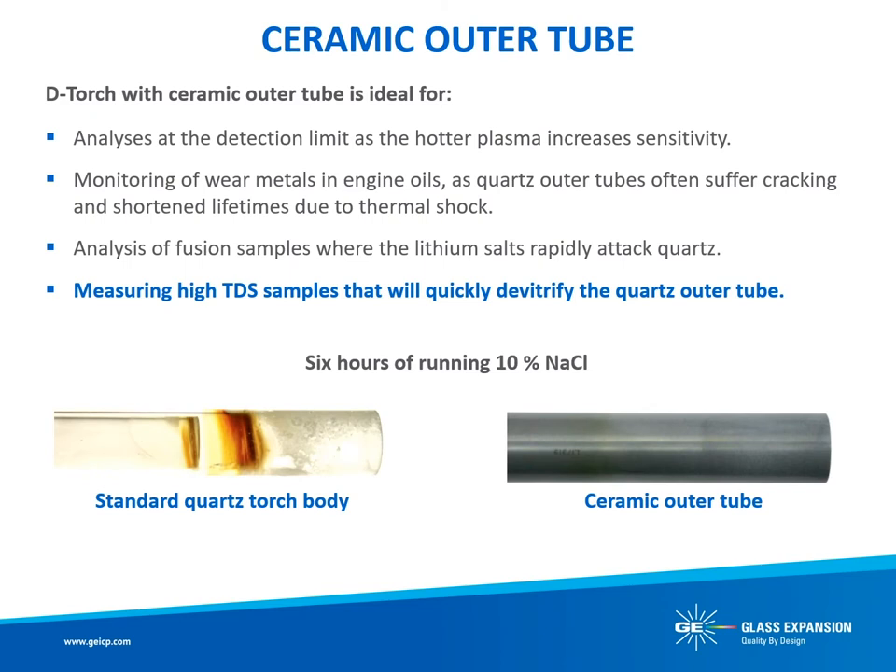Also unique to the D-Torch is our optional ceramic outer tube, which is of particular benefit for the analysis of aggressive sample matrices such as hydrofluoric acid, organic solvents, and high total dissolved solids, because the Cylon outer tube material does not de-vitrify and can withstand higher temperatures. Compared to a quartz outer tube, the ceramic outer tube has a much longer lifetime, greatly reducing maintenance, cleaning, and downtime due to torch failure. In some sample matrices, quartz outer tubes can degrade in hours, while the ceramic outer tube will last years under the same conditions. As an example, we can compare a quartz outer tube to a ceramic outer tube, both of which were exposed for 6 hours to a 10% sodium chloride analysis. You can clearly see that there is no change to the integrity of the ceramic outer tube, whereas the quartz is severely de-vitrified.